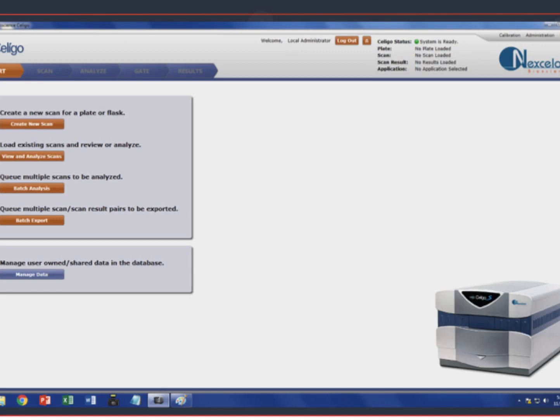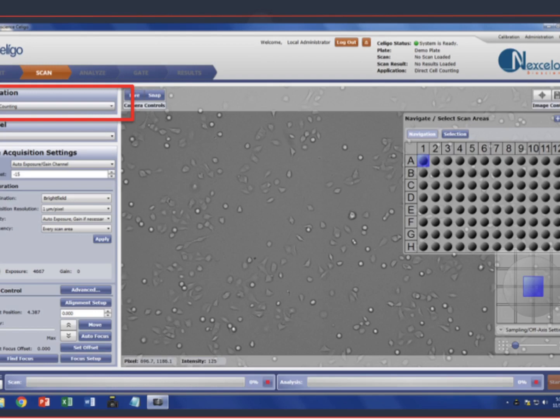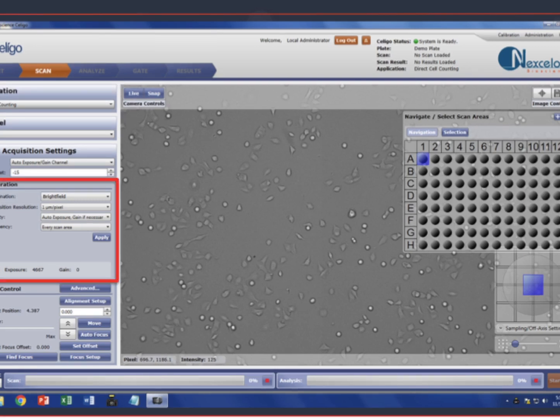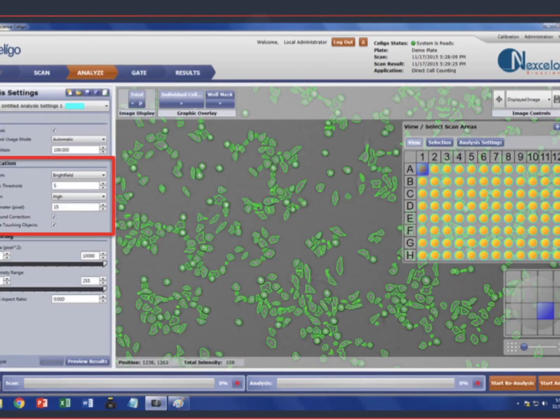Here is a generalized Soligo workflow. New scans are created by selecting Create New Scan from the Start tab. After selecting the proper plate type and providing a unique name, the software progresses to the Scan tab. The first step is to choose which application you will be using—here we select Direct Cell Counting, whose default imaging mode is Brightfield. The next step is to register the focus for the scan, done in one channel and one well. Following focus registration and initiation of the scan, the software brings you to the Analysis tab, where you can load saved settings or customize settings. Detected cells will be highlighted by a colored region of interest, allowing visual verification.